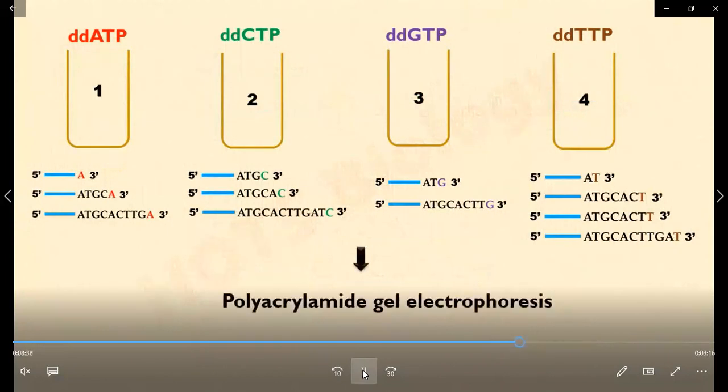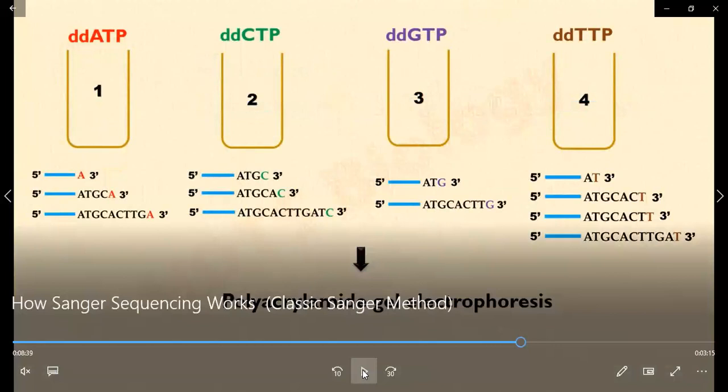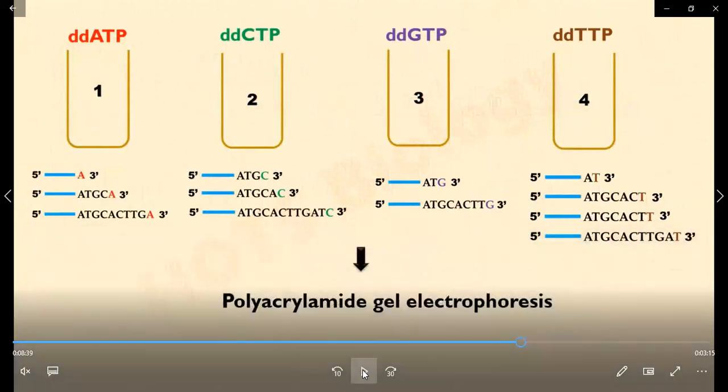Gel electrophoresis is a procedure which is carried out to separate these components, just like electrolysis that we have studied in chemistry. We have 2 types of gel electrophoresis: polyacrylamide gel electrophoresis or agar gel electrophoresis. Agar gel is used for larger, heavier components. Polyacrylamide gel is used for lighter and small size components. Because here we have small size components, we will use polyacrylamide gel. We will not use the thicker gel, because in that gel the movement of these fragments will become difficult.